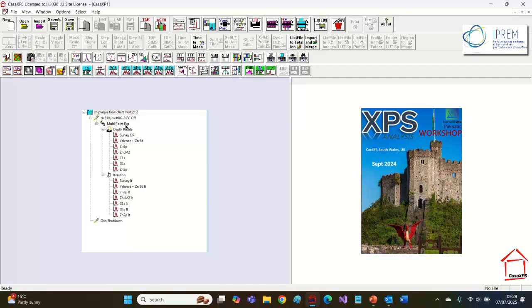The experiment that I'm going to look at involves a multipoint, a depth profile, and an iteration. The idea is that you set up a series of measurements based on these multi-points. Each point has a different name, hopefully, and the different positions on the sample are then measured using a depth profile. In this instance it's just a very simple profile, the as received, and then following sputtering another measurement. And just to illustrate that more can happen than the one type of experiment within this multi-point environment, there's also an iteration where just the same spectra are measured without any intervention such as the ion beam.